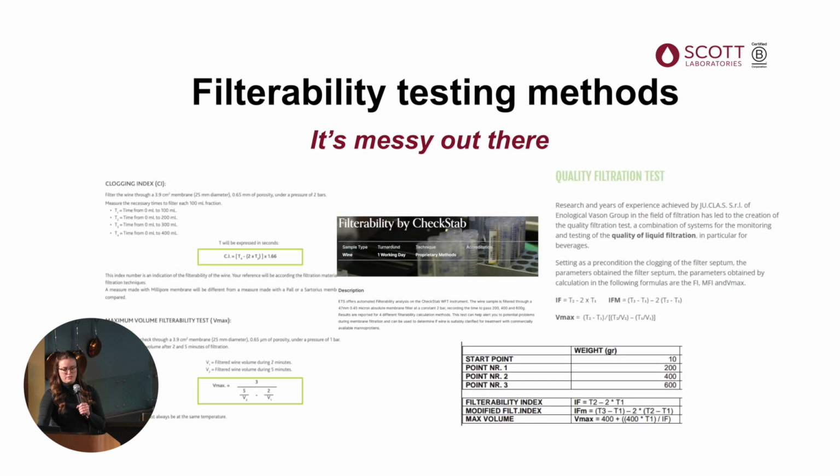So these are all different methodologies that I've found online and from official laboratories, and I'm going to show a lot of different collage slides like this. Don't worry about reading every single word on them. I'm trying to get the point across that it's complicated, and there's a lot of different people who are going to tell you how to do filterability differently. So that being said, across published methods, there's quite a bit of inconsistency in setup, in measurement, and in calculations.